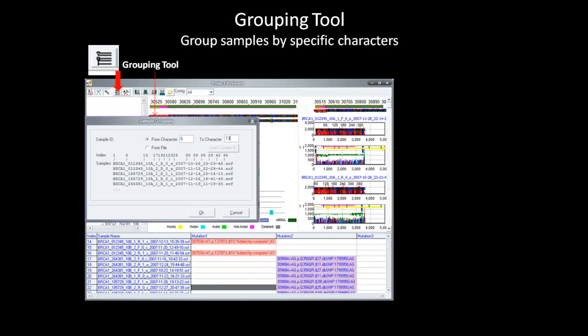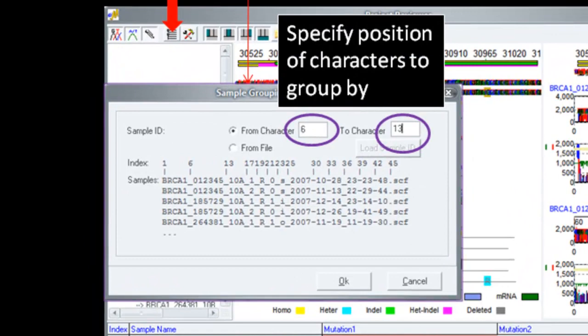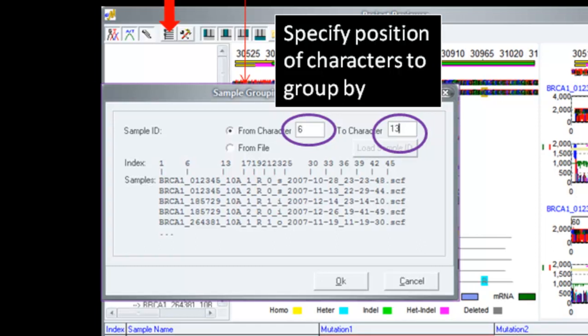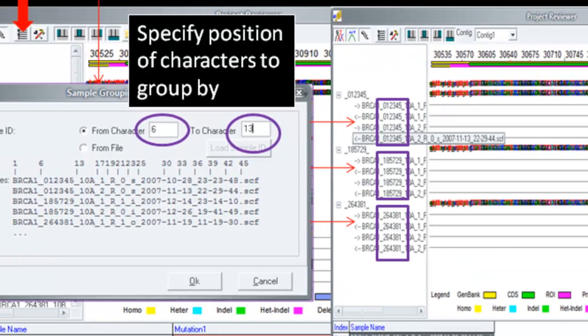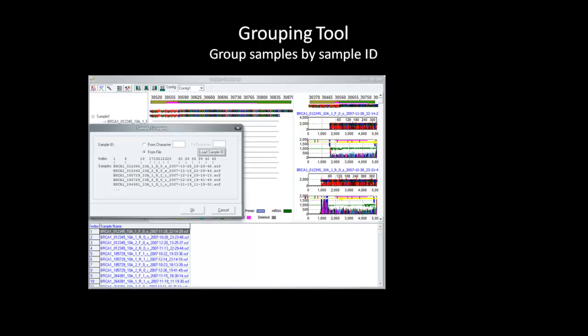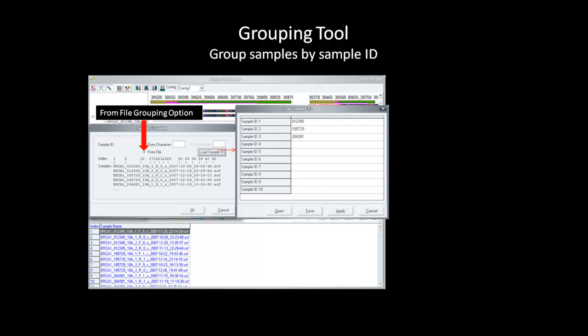We will first discuss the grouping by specific characters. In the dialog box, I told the software to group my samples by looking at characters 6 to 13. As you can see here, my samples are now grouped into three specific patient IDs numbered at characters 6 to 13. The other method to group is by using a From File option and then clicking Load Sample ID. This option is ideal for sample IDs that have varying length and are not fixed at a specific location in all samples.